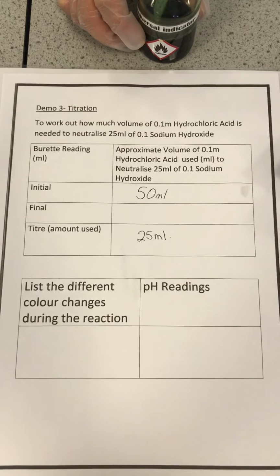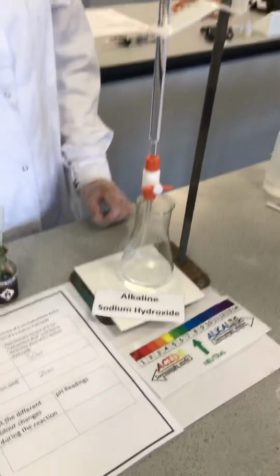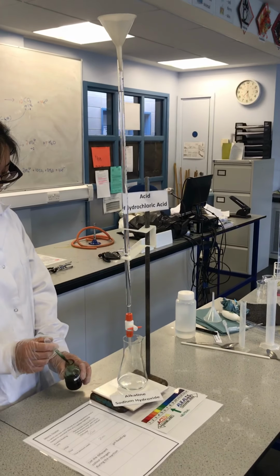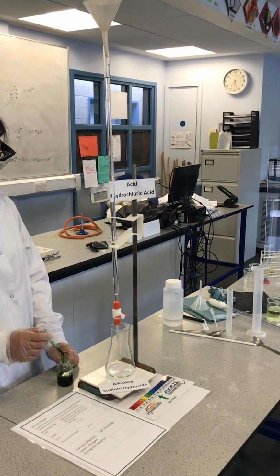Experiment 3, neutralization. Using a burette, we will do a simple titration. This is to determine the volumes of acid and alkali that must be mixed to obtain a solution containing only salt and water, or we say we have a neutralized solution.